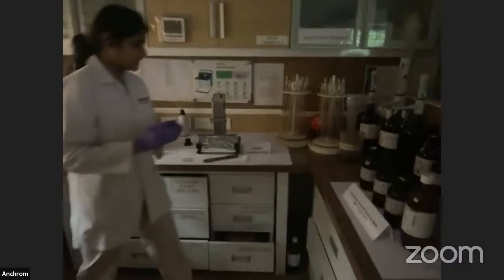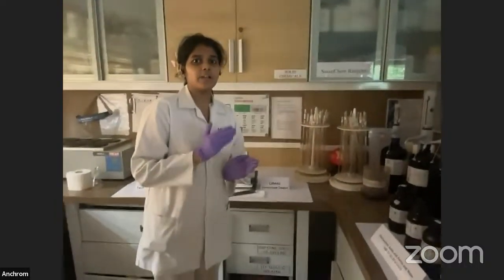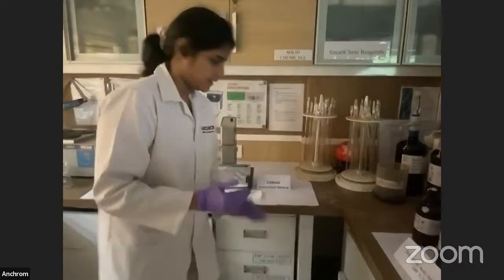I suppose the reaction time has been completed. Now we'll go ahead for image capturing.